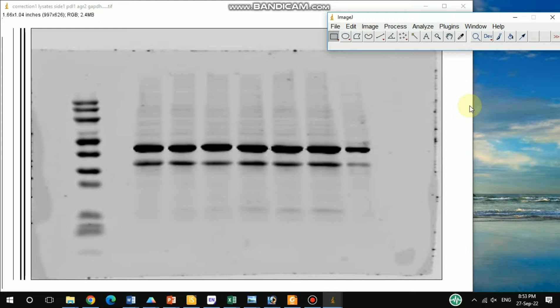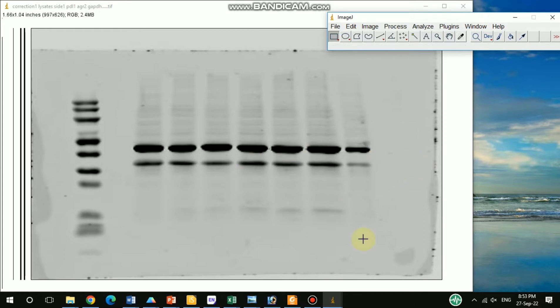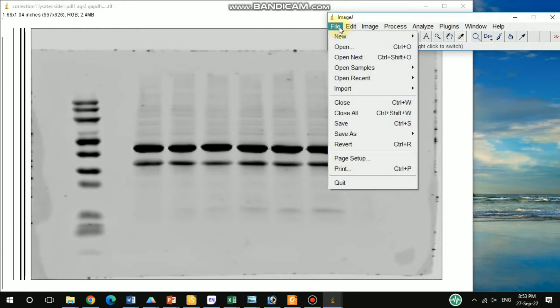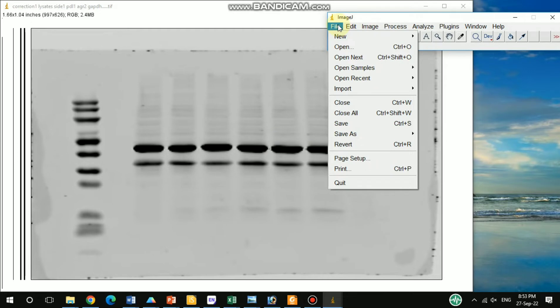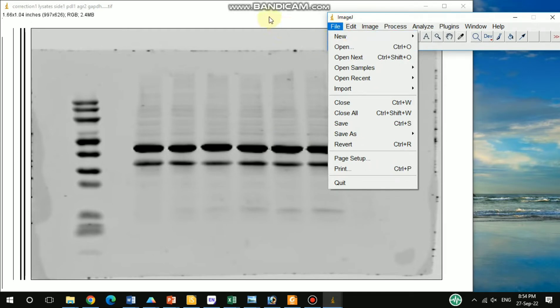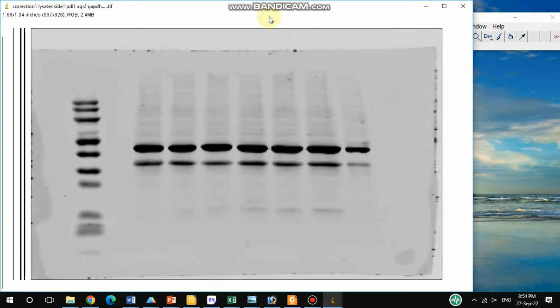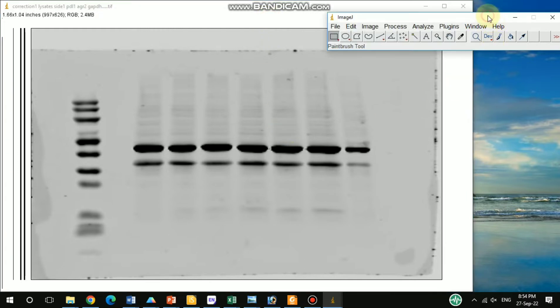First, I need to open the desired band. Here I already opened this file. To do that, you need to go under the File option and select Open, then open your file. I already opened it.